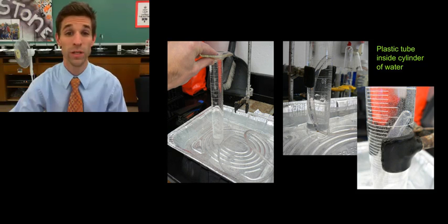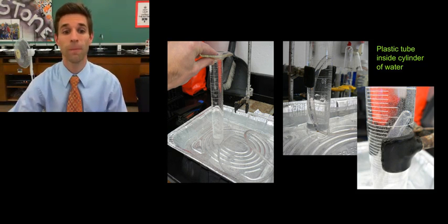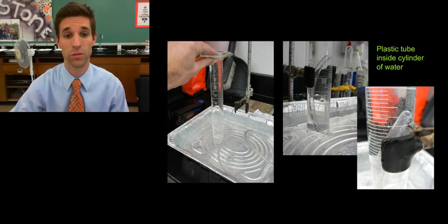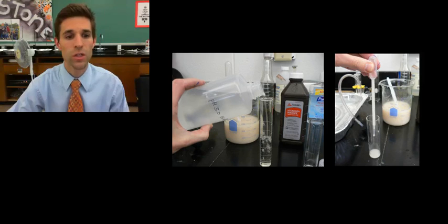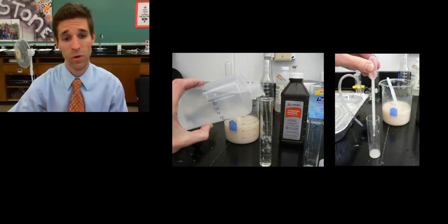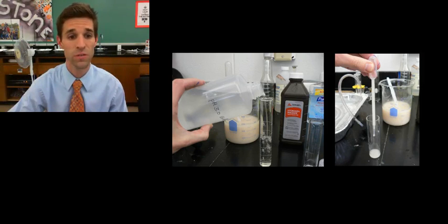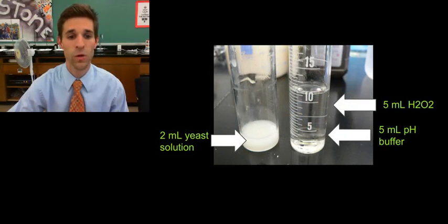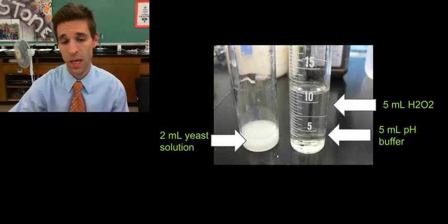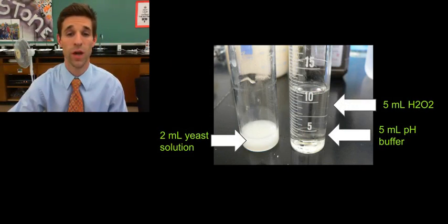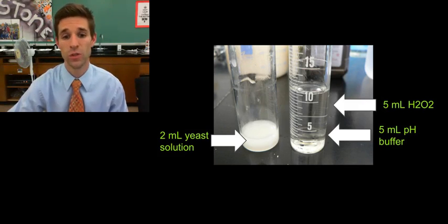And we actually want to know how quickly the reaction is happening, so we're actually going to measure oxygen production or gas production per second or per minute or something like that. So we prepare the solutions with the buffer and the hydrogen peroxide and using a pipette to get the right amount of yeast for the reaction. And you can see I'm pipetting the yeast into the reaction vial there. And so the yeast is in the reaction vial on the left, and in a smaller graduated cylinder I've measured out the appropriate amount of hydrogen peroxide, 5 milliliters.